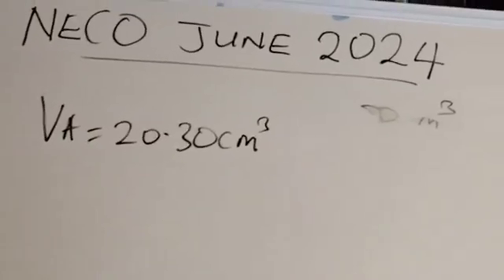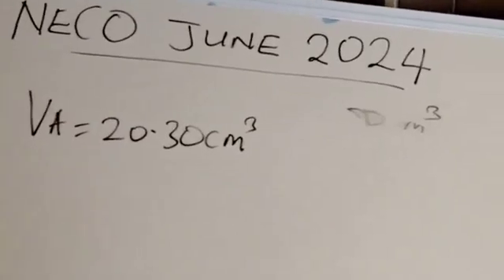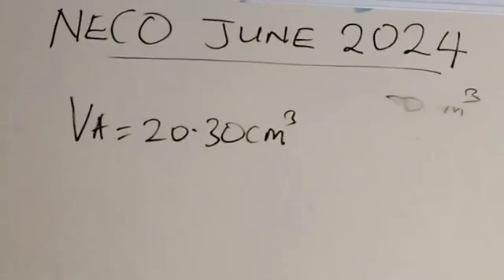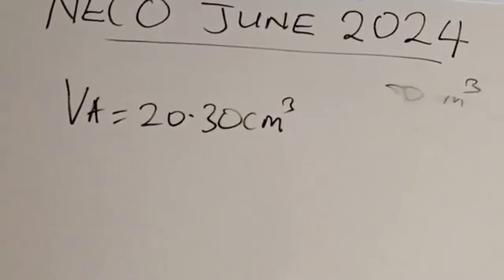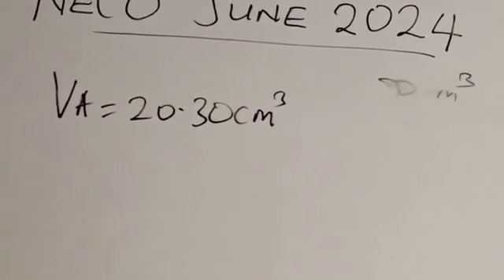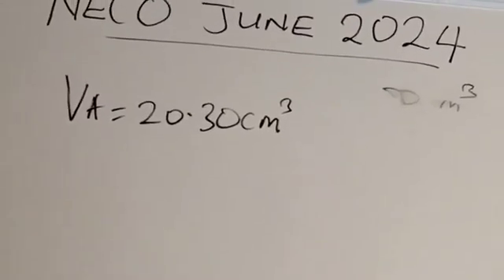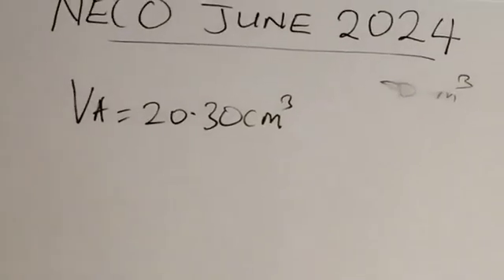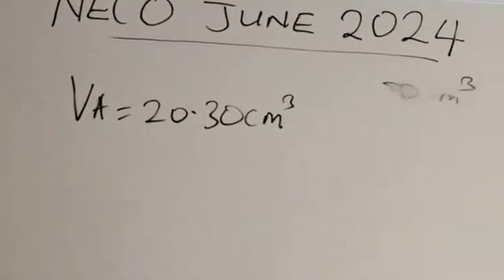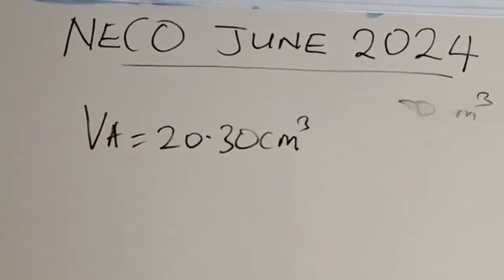Even though we obtained the correct endpoint, yes, the examination body provides an avenue for students to be judged based on the teacher's endpoint, because if your teacher probably used an acid that is expired, or an alkali that is expired, or impure water, it will affect the endpoint. And since he prepared your solution with the same chemical, you are not to be blamed. So they're going to judge you based on your teacher's endpoint.